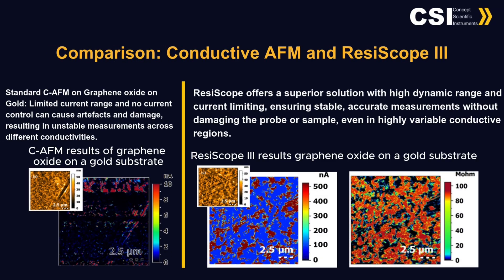Resoscope 3 offers significant advantages. As you can see in the sample scan results of graphene oxide on a gold substrate, CAFM can produce artifacts and potentially damage samples due to its limited current control. Resoscope 3, however, features a high dynamic range and current limiting, ensuring precise and stable measurements.